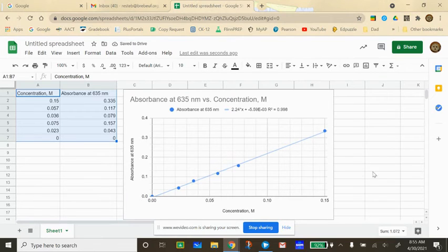So close that down and take a look at your graph. You've got your y-axis and x-axis already labeled, you've got the title, you've got an r² value, and you have y equals mx plus b. When you get data for the absorbance of your unknown, I'm going to make a copy of this page. On your lab, it says something about drawing a best fit line.